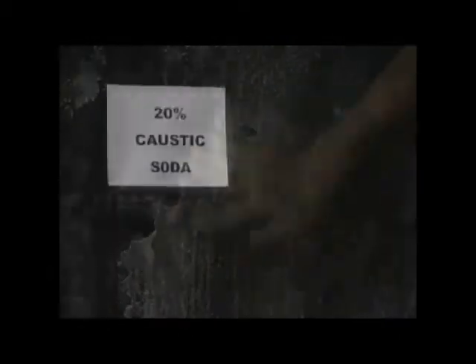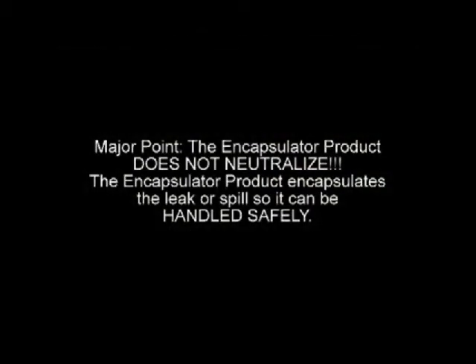Do not try this. The encapsulated 96% sulfuric acid can be removed from the wall by wiping it with an ungloved hand. Do not try this. The encapsulated 20% caustic soda can be removed from the wall by wiping it with an ungloved hand. Major point: the encapsulator product does not neutralize. The encapsulator product encapsulates the leak or spill so it can be handled safely.